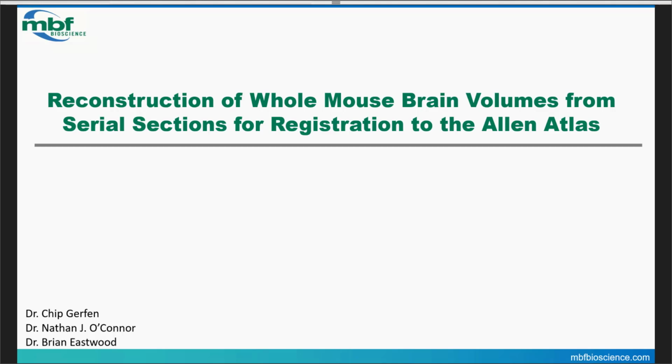Hey everyone, I want to say thanks for attending our webinar today. This is a webinar that's in one of a continuing series. And today we're going to talk about reconstructing whole mouse brain volumes from serial sections for registration to the Allen Atlas and its coordinate system.